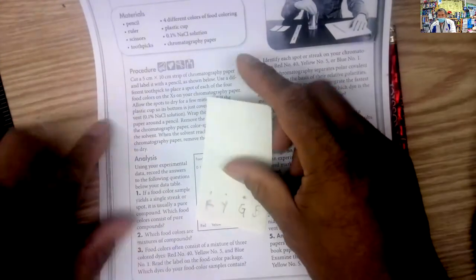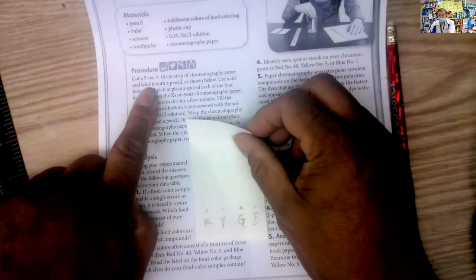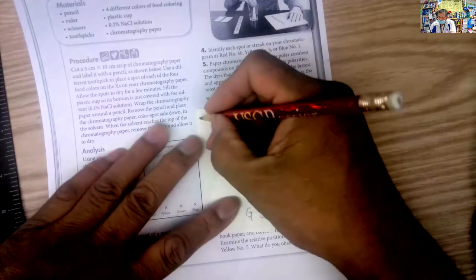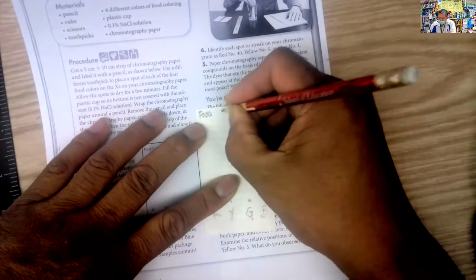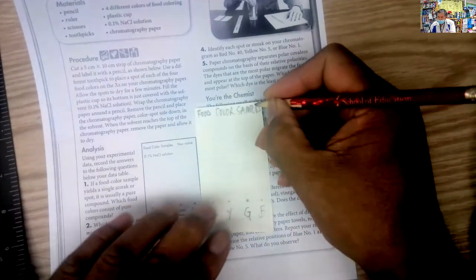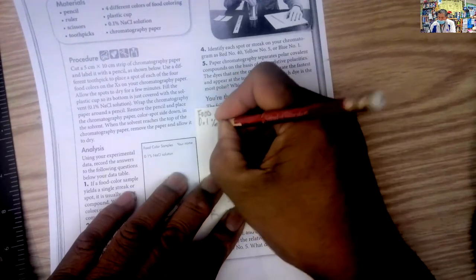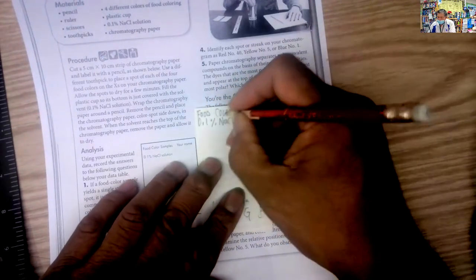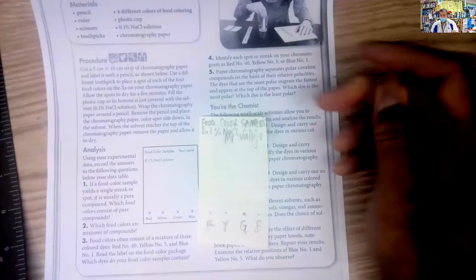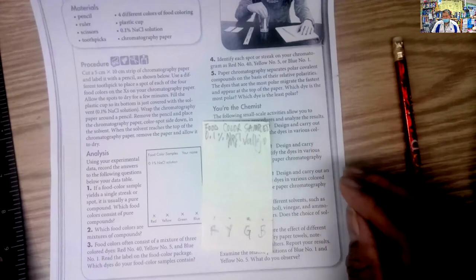As you can see from the instructions, cut a 5 cm by 10 cm strip of chromatography paper, label it with a pencil as shown. So now I want to label it like this one here, with the food color samples, a 0.1% NaCl solution, and then my name. Maybe I can write smaller, but you'll have a separation and this will be fine. Okay, so now I've got that.